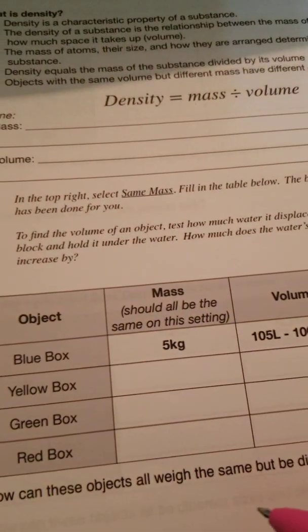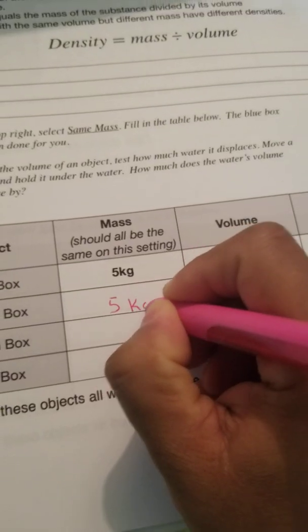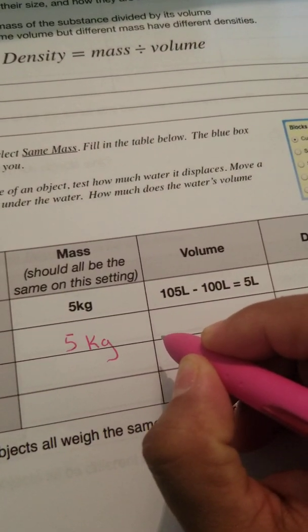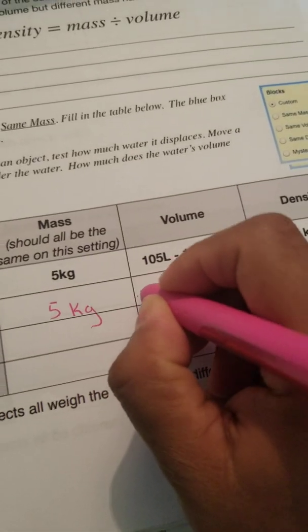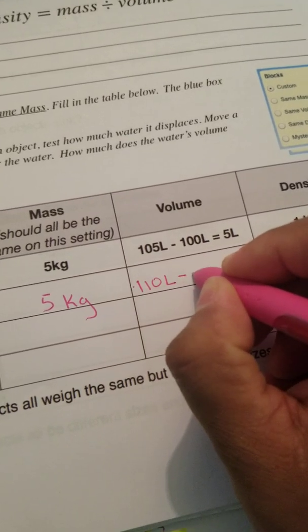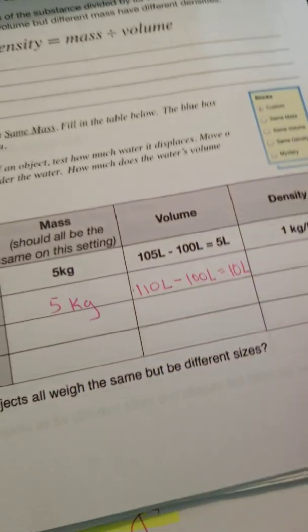I'm going to grab a pen. I'm going to come over here. The yellow box was 5 kilograms. The original volume and the displacement volume: when I held it under the water, it was 110 liters minus the original 100 liters equals 10 liters.